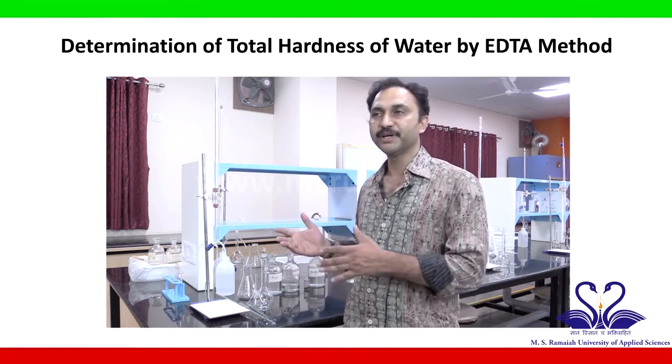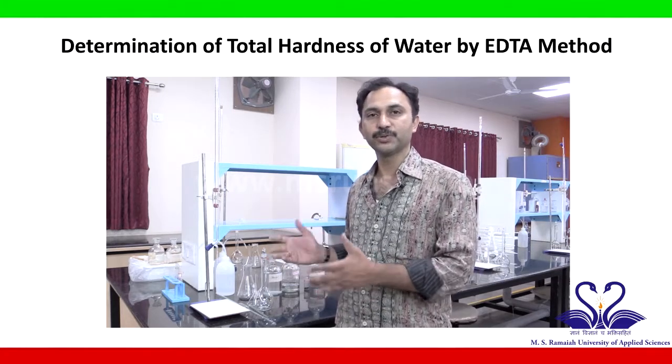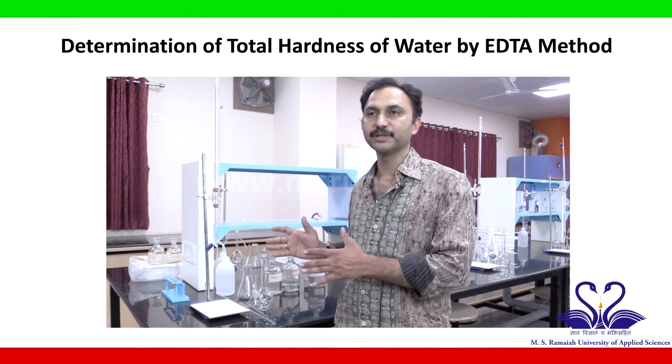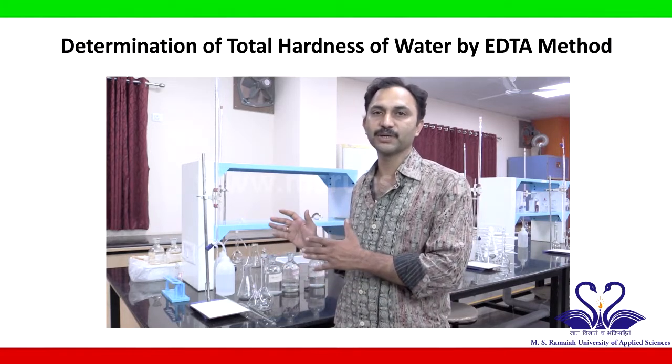So in today's experiment, we are going to find out total hardness. We are not going to differentiate whether it is temporary or permanent. We are going to determine the total hardness of the given water sample.